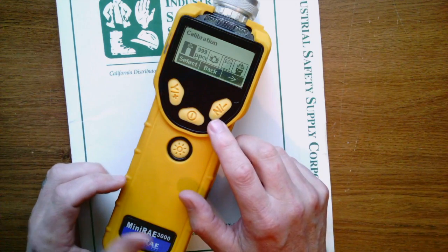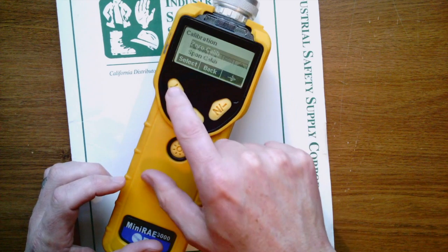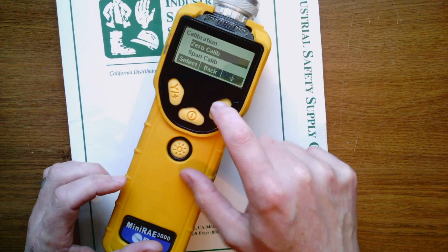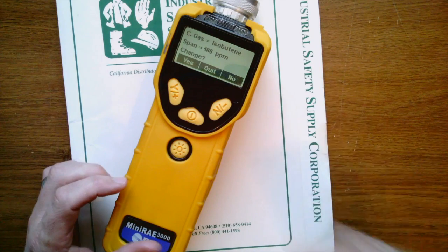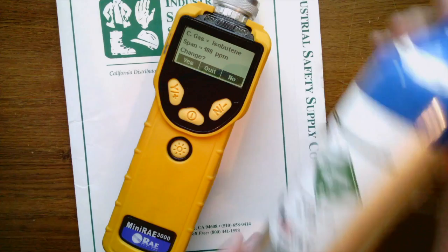First thing that pops up is calibration. We're going to go ahead and hit the soft arrow select key, and if it wants to do a zero calibration we would do that here. Today we're just going to perform a span calibration. We're going to hit the select button and it asks us if we're going to be utilizing isobutylene 100 ppm. We are.